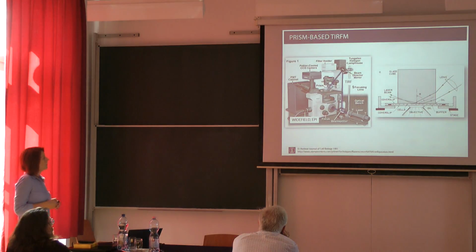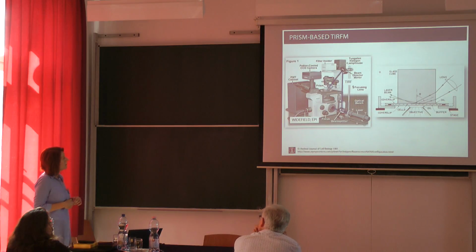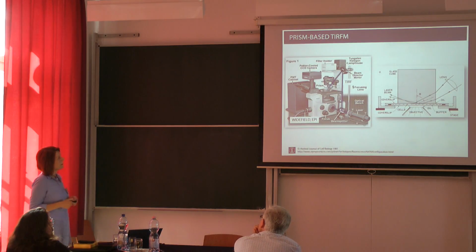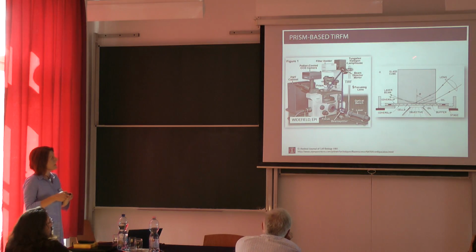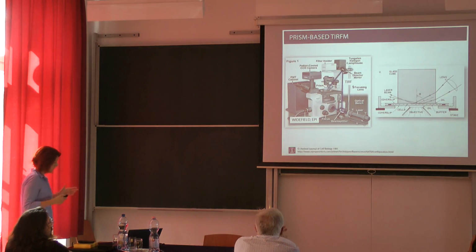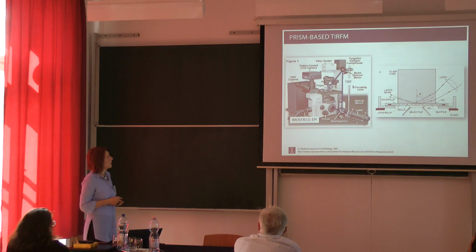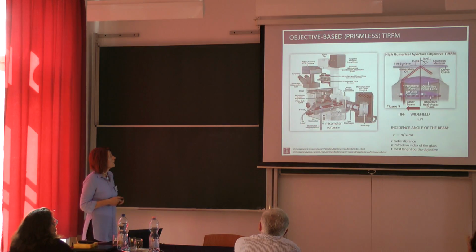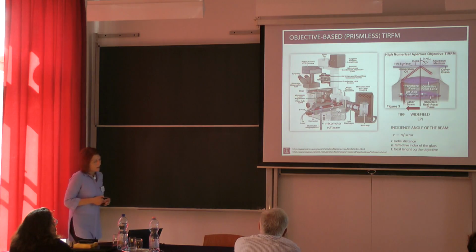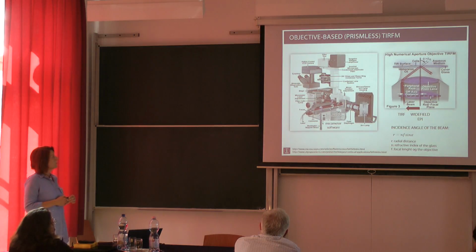Of course, other solutions are available where the laser is introduced from the bottom, so you can have access to your sample, which can be important if you want to, for example, micro-inject your cells or change the protein content in your sample. Most commonly used are the objective-based TIRF microscopes.